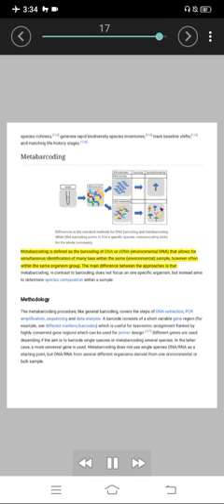Metabarcoding is defined as the barcoding of DNA or eDNA, environmental DNA, that allows for simultaneous identification of many taxa within the same environmental sample, however often within the same organism group. The main difference between the approaches is that metabarcoding, in contrast to barcoding, does not focus on one specific organism, but instead aims to determine species composition within a sample.